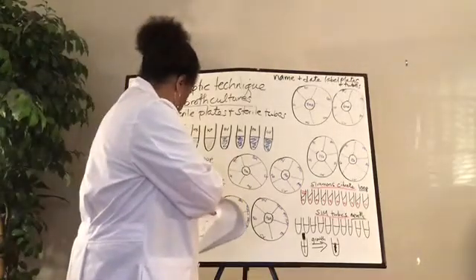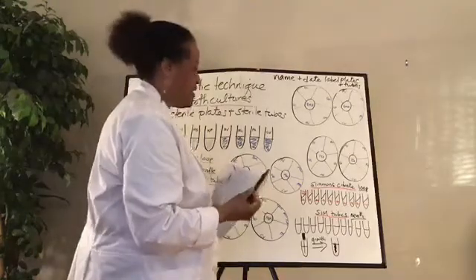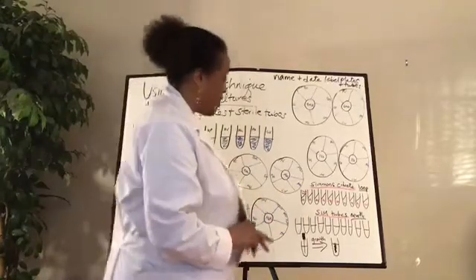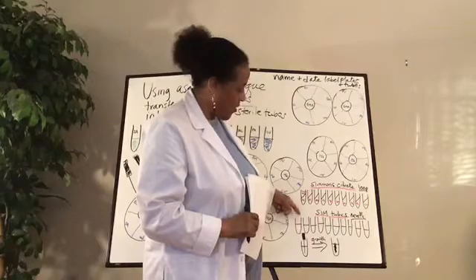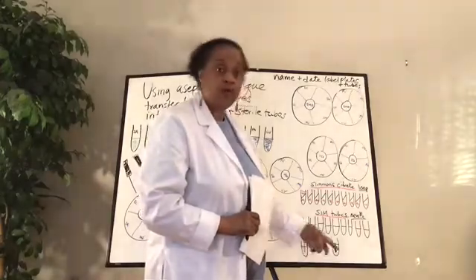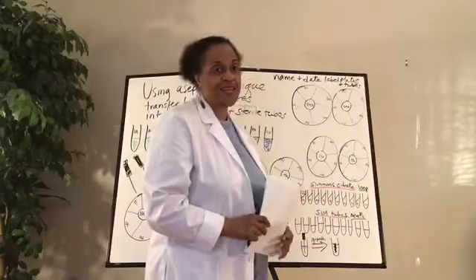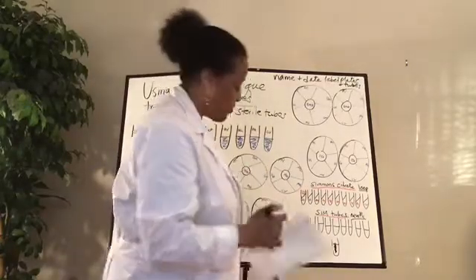This one here, this is the Sims tubes with the needle. I showed here that when you poke the needle down in here, you drag the needle straight out, and then in about 24 to 48 hours, you should see growth if it is one that will grow in this type of medium. But that one I want you to remember is the Sim tube, you use a needle.